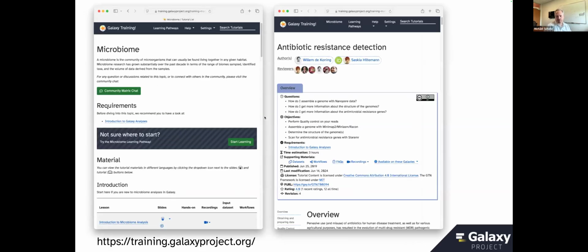For today, a couple of resources I want to highlight. We have a whole set of trainings dedicated to the microbiome. If you click through there, there's several dozen. Here's one I just picked. If you're very interested in, say, antibiotic resistance gene detection, there's a very detailed tutorial there that will work through how you can do quality control, how you can do assembly, how you can look at the overall structure of the genome, and then dive right in and look for some of the key genes there. So if you're following along today but maybe missed a couple of steps, go check out these trainings that have a very detailed click-by-click, step-by-step description of what you need to do.